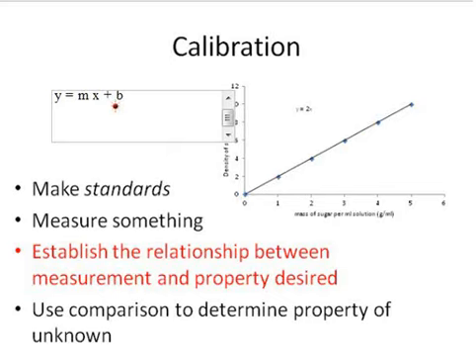And those are the two things we're trying to determine in this experiment. It's the m and the b that goes with our chosen y and x. So the way that you do that in Excel is there's something built in after you create a graph called a trend line, and there are instructions in the lab manual about how to create one of these trend lines. And when you create the trend line, the line will actually show up on the graph, as it should, because that shows the relationship of the data. And it also will show up as an equation on the graph.